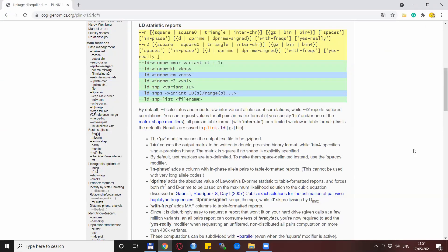But before we go anywhere, let me show you the help page of LD computations with Plink. You see that there are quite a number of options and we will show some of them, but I encourage you to check this one out in detail. Also read the explanations and perhaps experiment a little bit with the various options and option combinations.